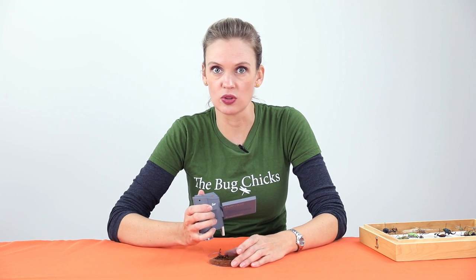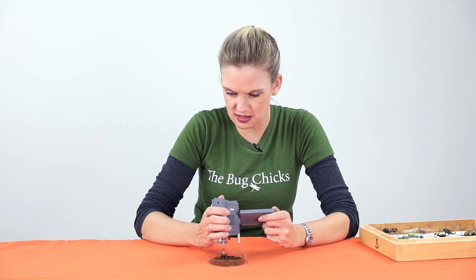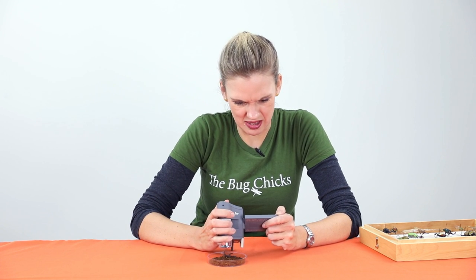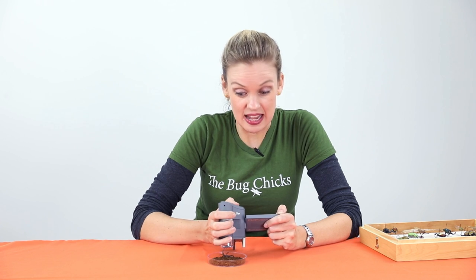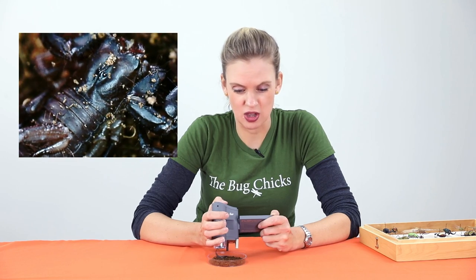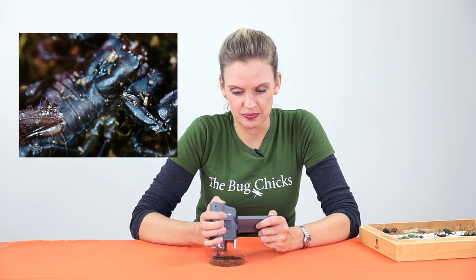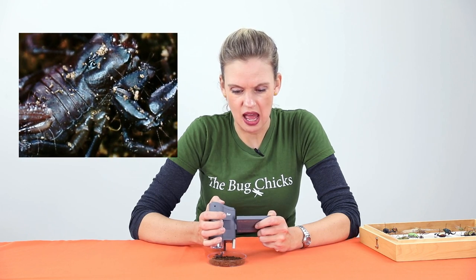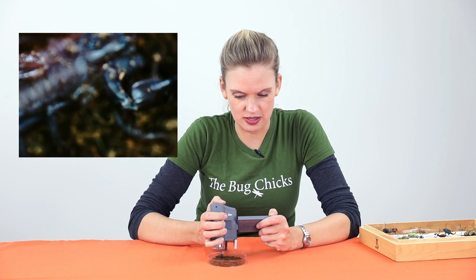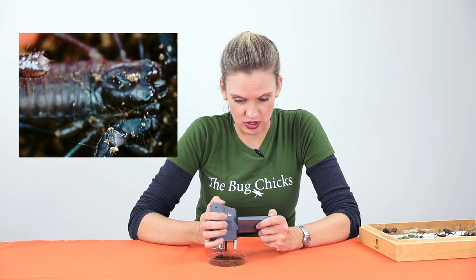Now with video, it's vital that you are as stable and still as possible. So I really like to brace, and sometimes I put the FlipView down like this and hit the same camera button and now I'm recording. If you're filming a bug — like I'm filming the scorpion — I really want to make sure that the eyes are in focus. So that's what I am focusing on, making sure that those eyes are in sharp focus.